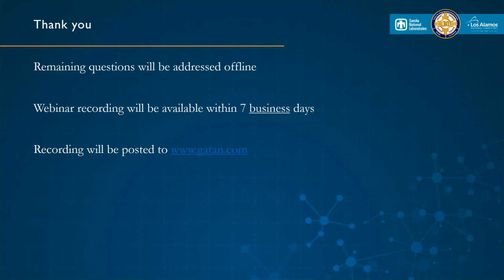Yeah, and I would just add there that we have free tools in GMS also to process these large in situ data sets, and part of the primary purpose of those tools is to reduce down the amount of data in a smart way without losing important information. So those tools are something we provide for free.